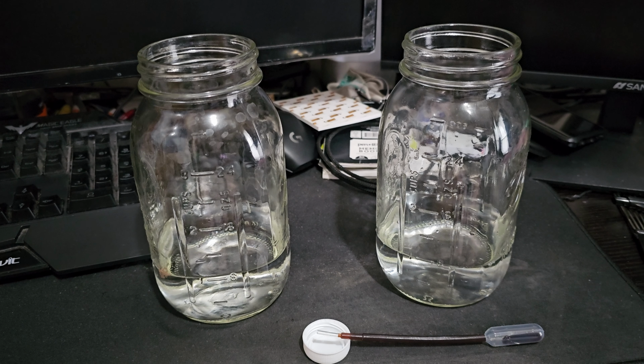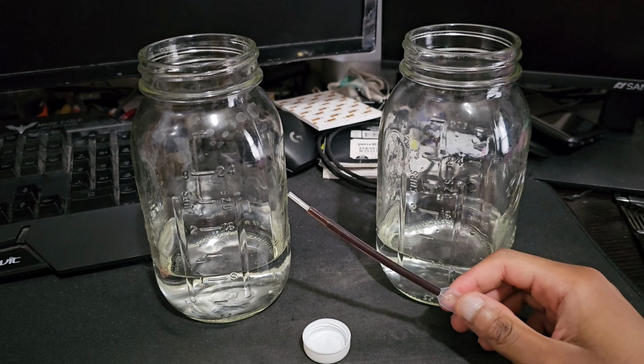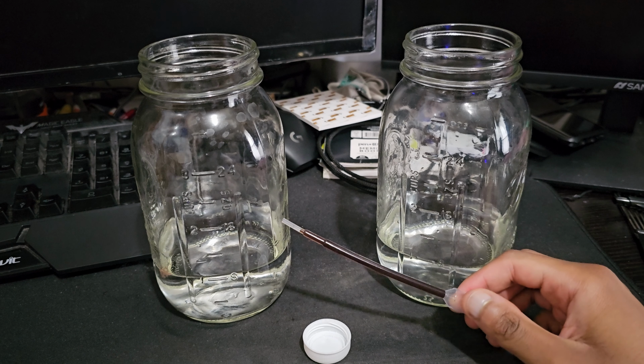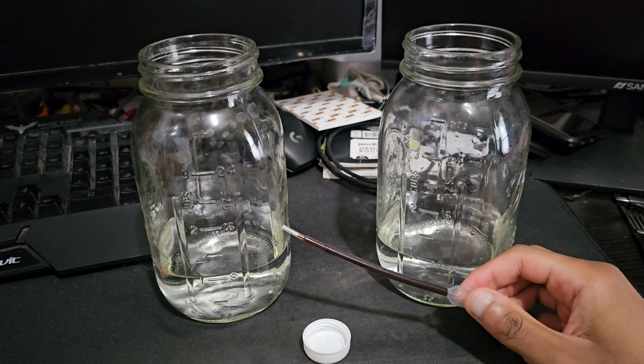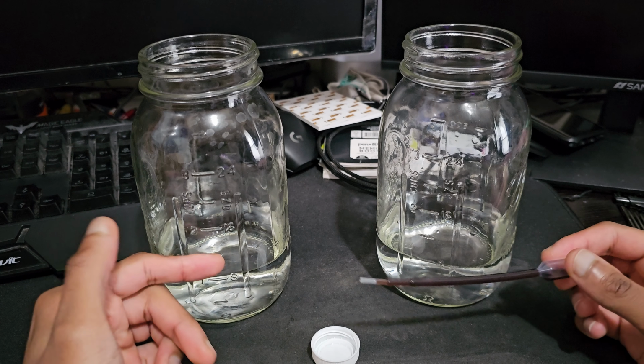And I have some water out of my worm bin, which I should probably do some maintenance on. I haven't done much with it. So I'm thinking, I got this bottle cap. Maybe I'll fill up to a certain amount just to make sure there's a nice equal amount in it.